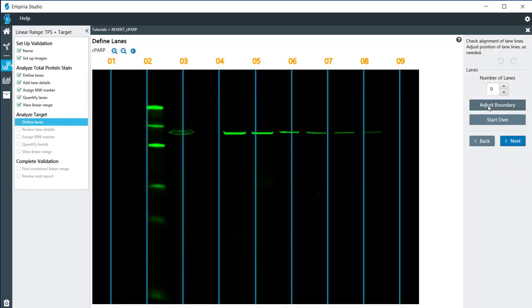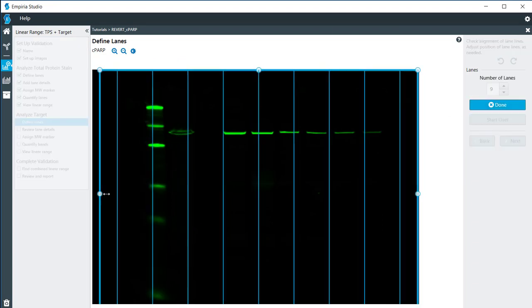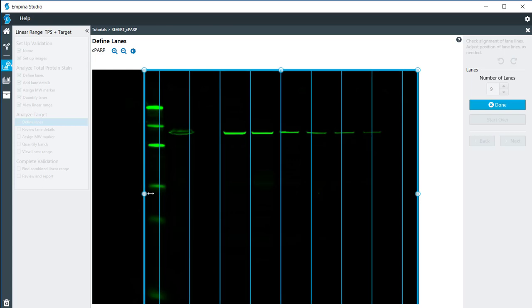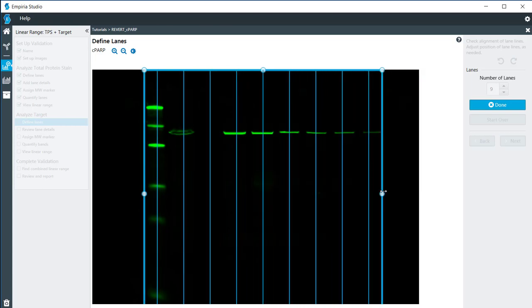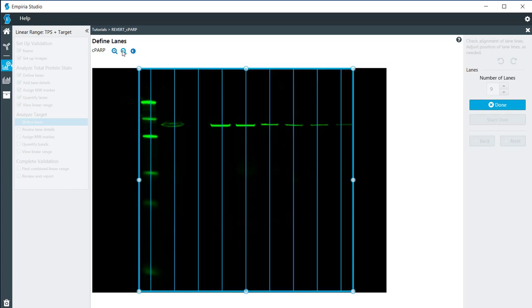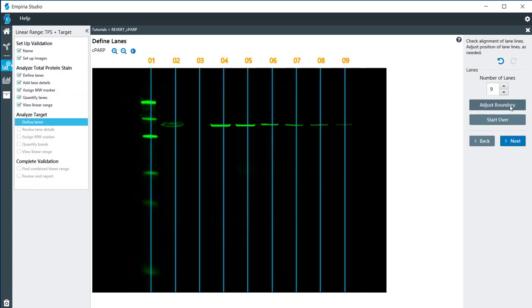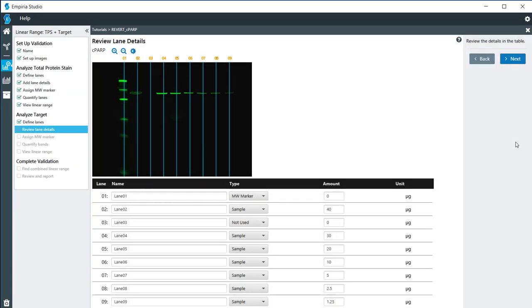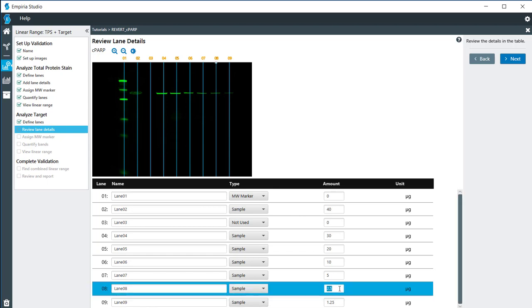Now here I'm going to adjust the boundary for my target protein. Again I have nine lanes on here, so I just want to adjust this so that it encompasses the lanes. Everything looks okay. I'm going to click on done and then click next. It's going to pull the same information since these are from the same blot. If you needed to, if they did have for some reason different loading amounts, you could change those right there.